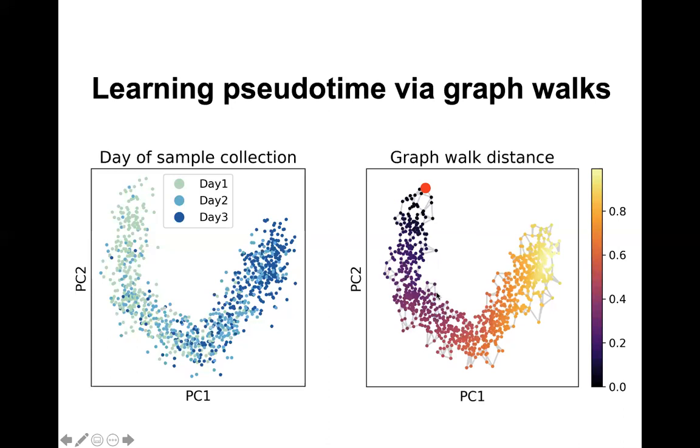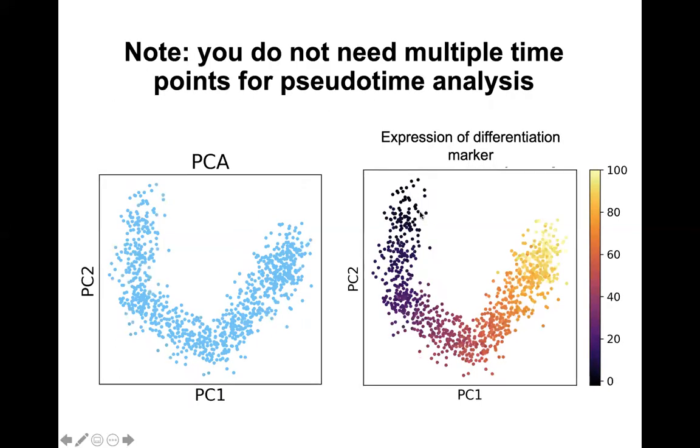So you ask, how do you determine the earliest point? I will first of all say, great question for the Slack. But I'll address it now. Imagine that you know something about the biological system you're studying. People usually don't just pick up a single cell data set off the street. Usually you are studying a system that you sort of understand. It might be stem cells, for example, and maybe there's a stem cell marker like OCT4, and you see expression of that is really early here, and so you select it. We're actually going to give you a task where you can do this in one of the notebooks today. You can get some experience picking that earliest point. It's exactly that question. It's the next slide. I forgot that.